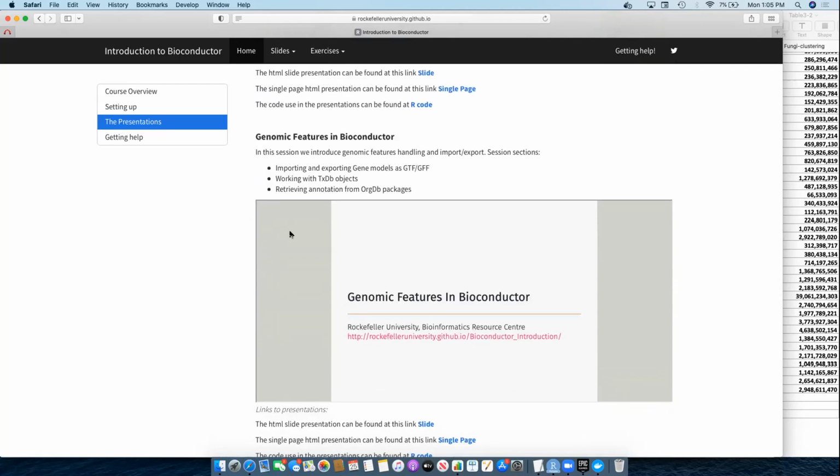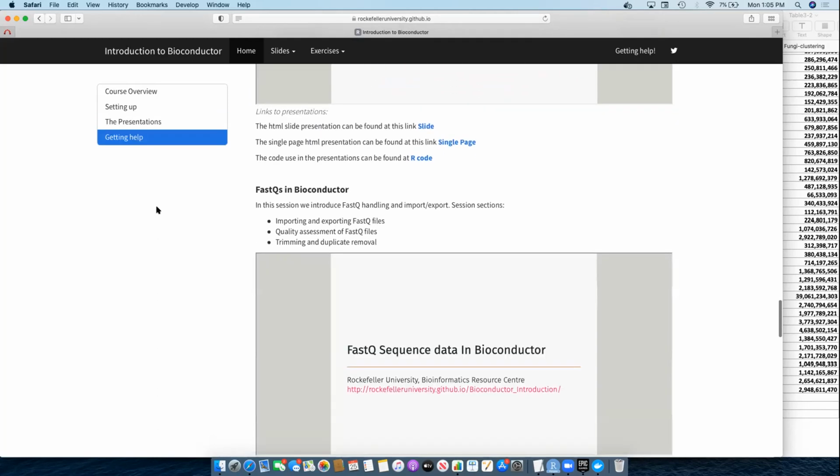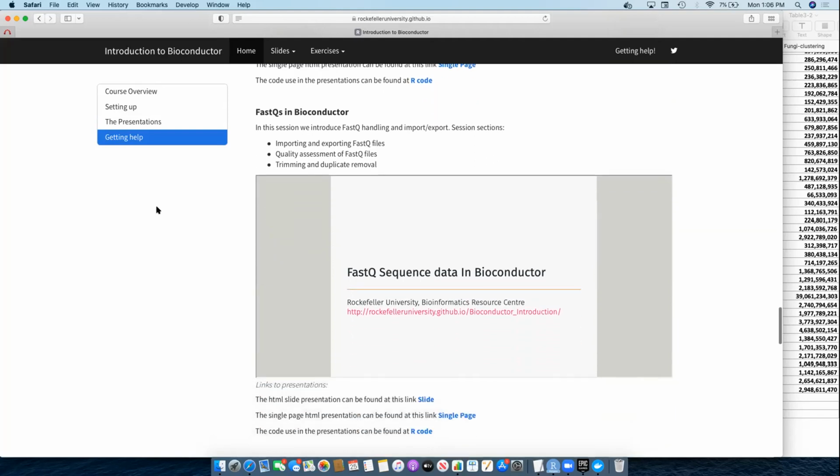And then we looked at genomic features, which is what handles our GFF, GTF objects. And it's these we will use for counting over gene models, or even, as we'll see later on, annotating peaks to their nearest TSS, peaks to the region of a gene.